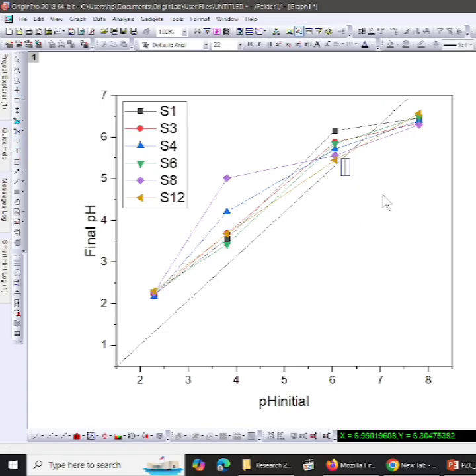So this is all about drawing the point of zero charge, and we already know what the point of zero charge means, and what it means if the pH is below or above it. Simultaneously, we can insert these graphs into the effect of pH section and explain the behavior of our pollutant with respect to different pH, from the extremely acidic medium to the extremely basic medium, depending on the point of zero charge we got for the specific kind of adsorbent or membrane.